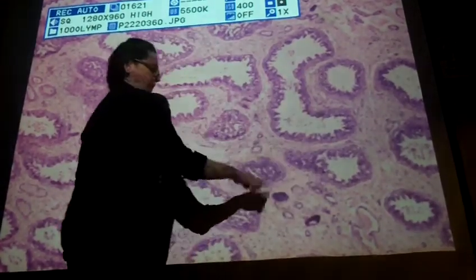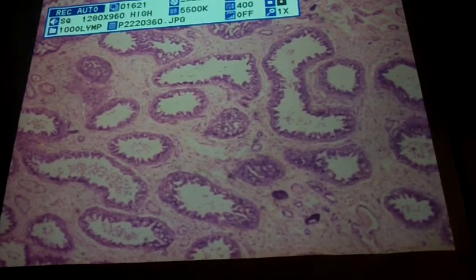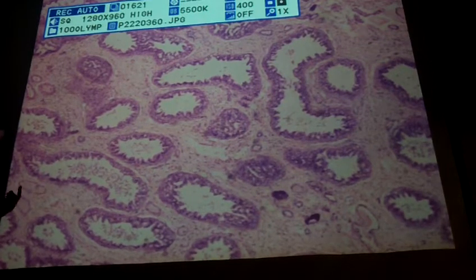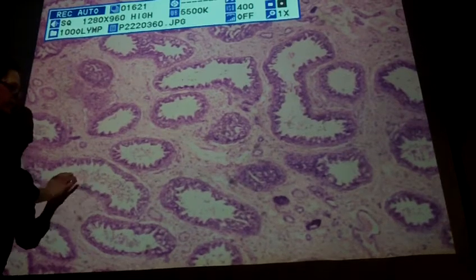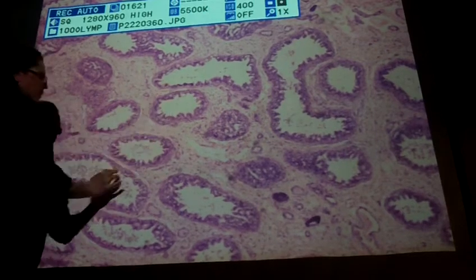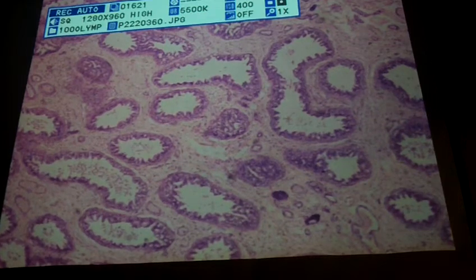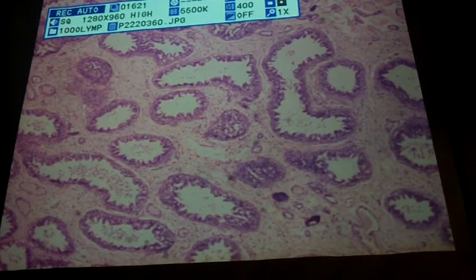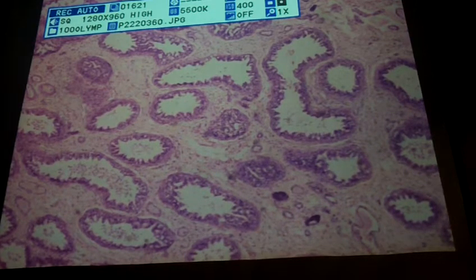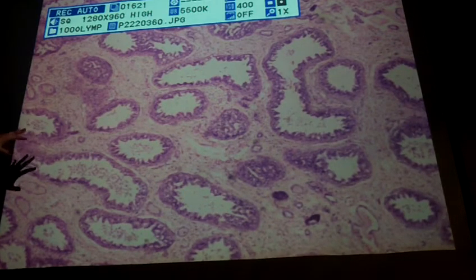So all of those circular areas are the tubes that the sperm is swimming through, right? And when you cross-section it, you just see all these little circles. And in a lot of these, you see sperm, so that's what all of this here is in the middle. Those are all sperm. And generally, you're going to find more sperm in the epididymis than you would in the testes, because sperm go to the epididymis to mature and hang out and wait. Chances are you will see some sperm in the testes as well, but you're going to see just sperm that are traveling through the testes to get here.